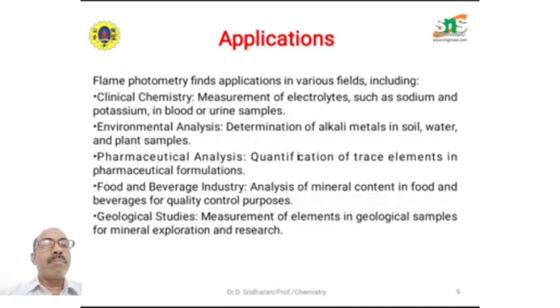Applications of this technique, flame photometry: clinical chemistry, environmental analysis, pharmaceutical analysis, food and beverage industry, and geological studies.